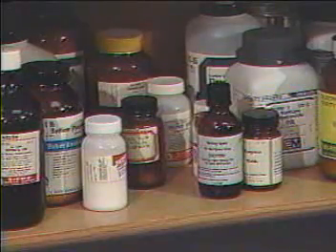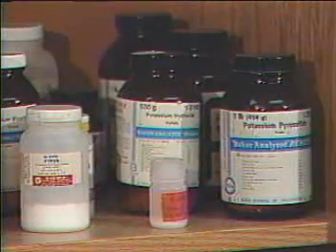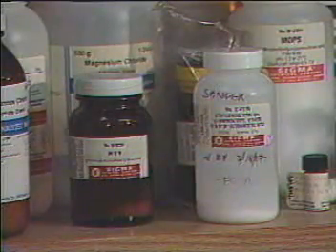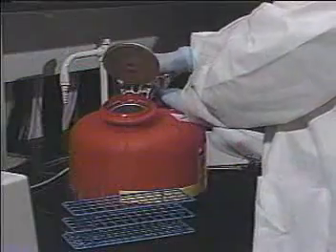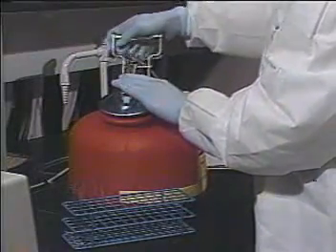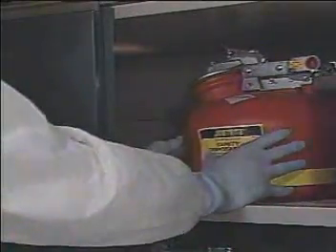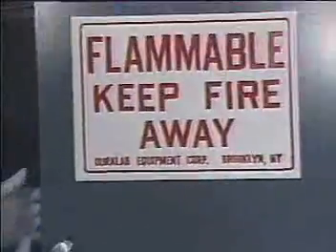Each chemical should have a definite storage place to return it to after each use. Avoid exposure to heat or direct sunlight. Flammable liquid should be stored in approved safety containers. Red with yellow tape identifies substances having low flash points. Arrestor spouts help prevent flashback.